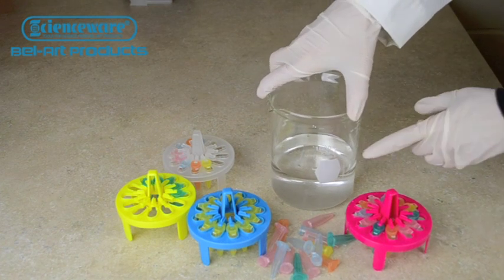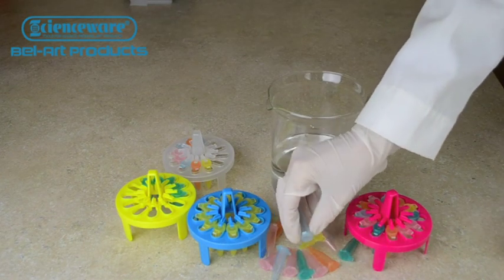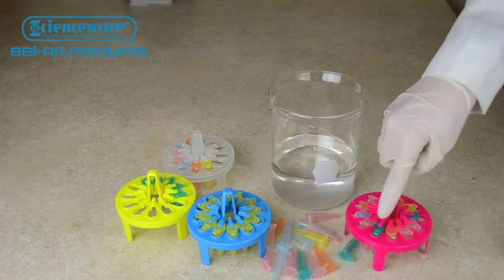PrepSafe Racks fit most 1,000 mil beakers and hold up to 12 1.5 or 2 mil microcentrifuge tubes in numbered locations.